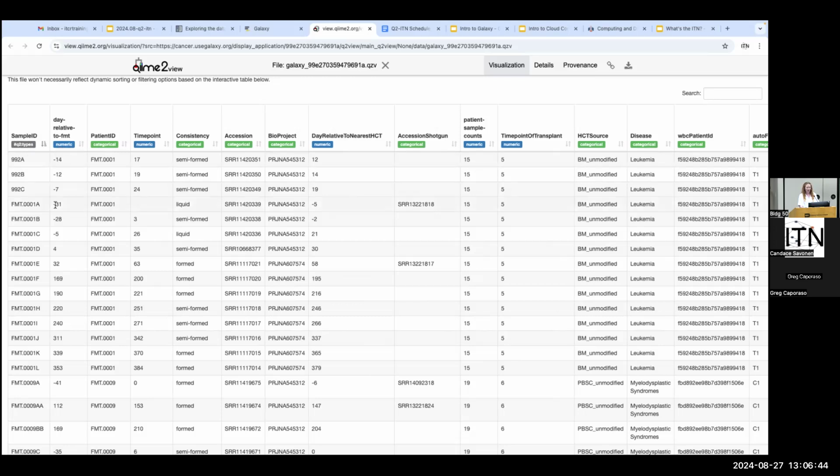If it's just numerical values inside of the column, it will say, oh, this is a numeric column, and it will label it as a numeric column for you automatically. And if it sees alphanumeric or anything else besides numeric, it will label it as categorical. Luckily, if you want to override this, you don't want QIIME to do it, you can do this yourself, and you can set these before you load it in or at any point.